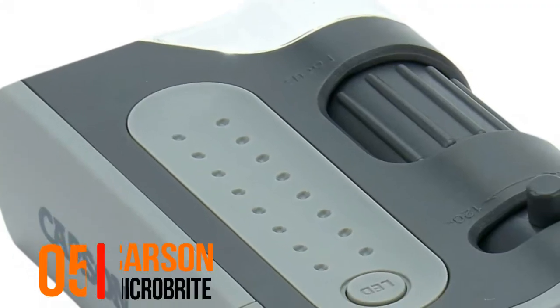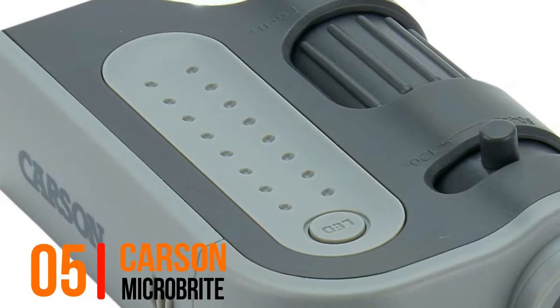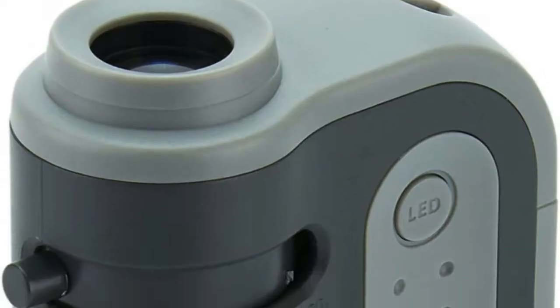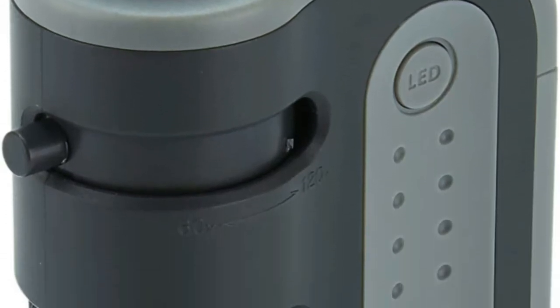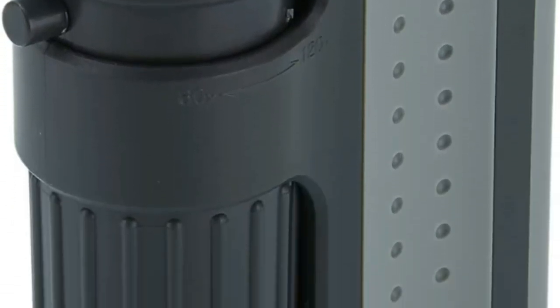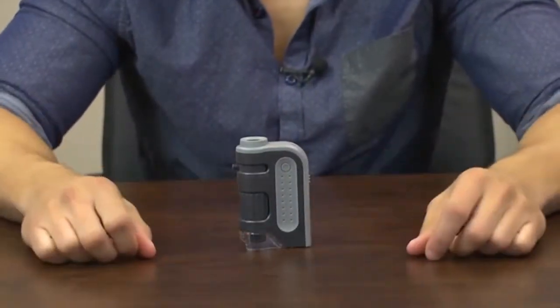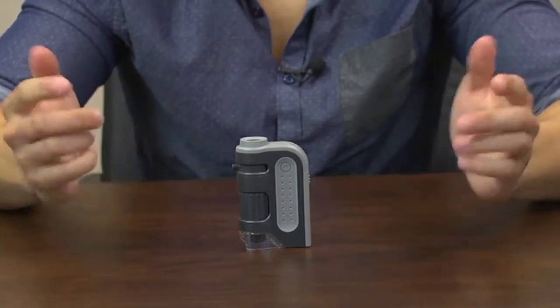Number 5, Carson micro bright. Hey what's up guys, this is Doug from Carson optical and today we've got an LED lighted pocket microscope of ours called the micro bright plus. And right away you can see it, this is nice and compact. As far as pocket microscopes go this one couldn't be more simple to use.